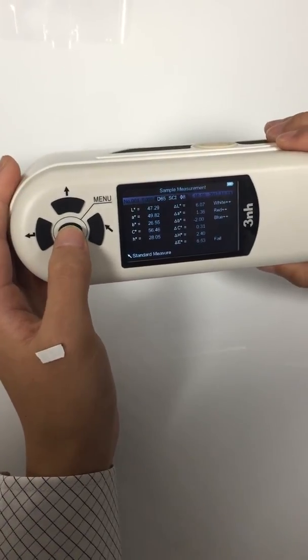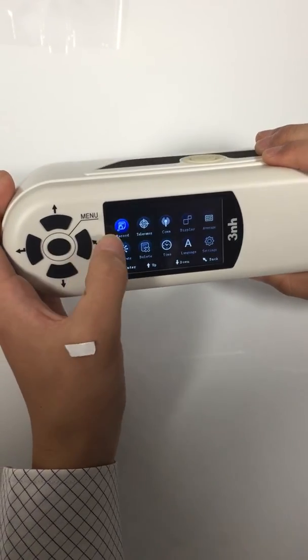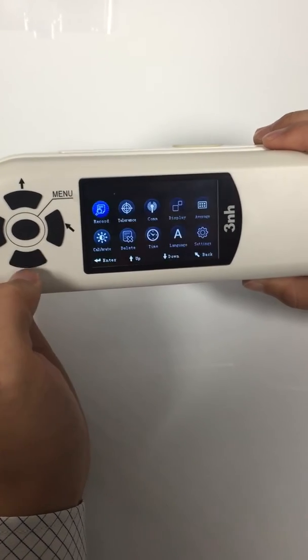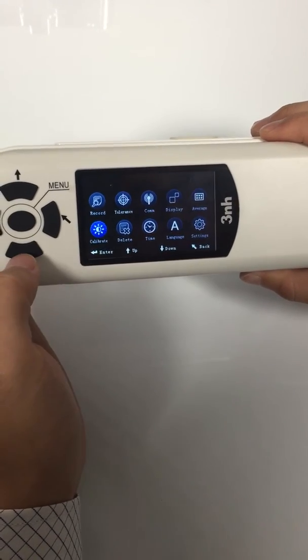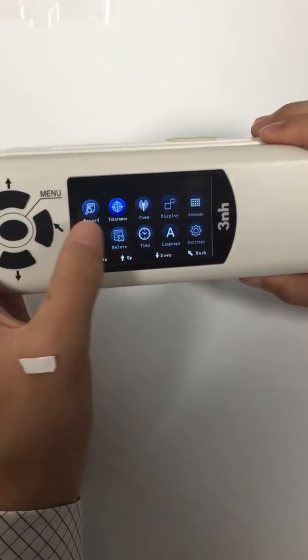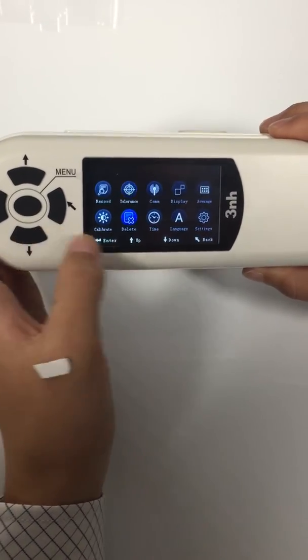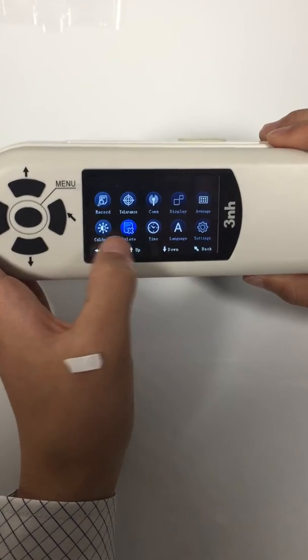Let's check the menu interface. Records for checking the standards. Calibrate for calibration. Tolerance to set tolerance. Delete to remove records.